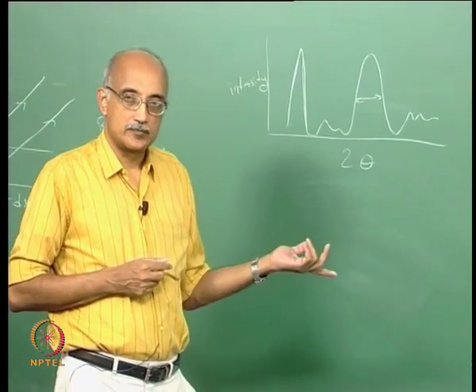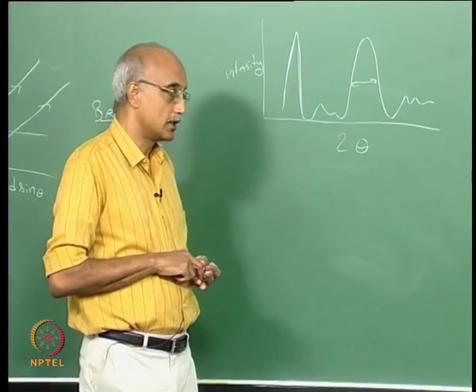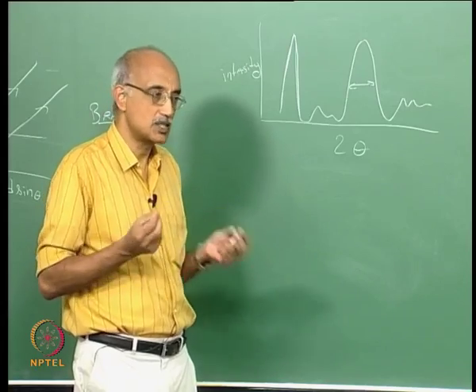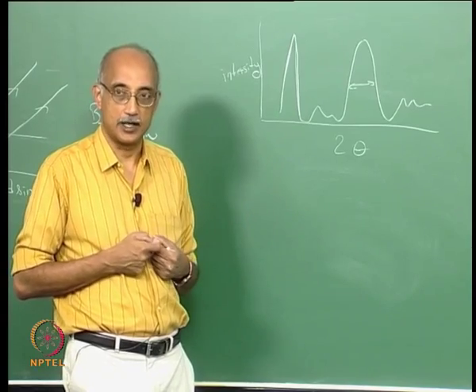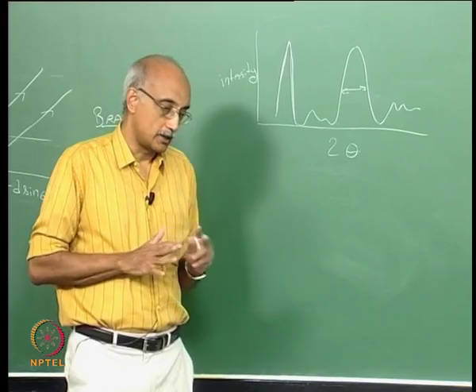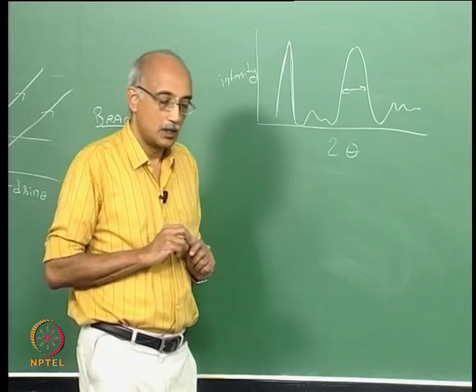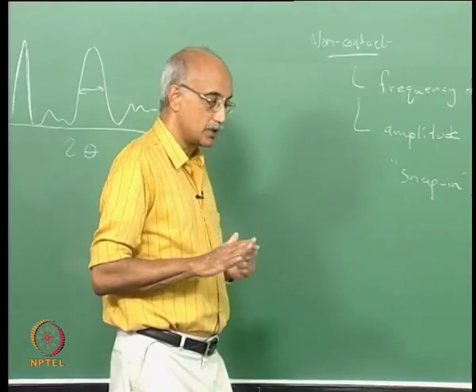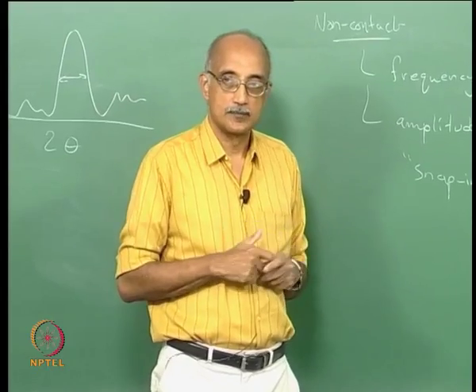and so is XRD. And again, if you look in literature on particle characterization, especially again as you go to the nano sizes, you will see that the literature is dominated by results obtained using these two instruments, XRD and AFM. So these are techniques that are absolutely vital if you want to get into nanotechnology. And so it's a good lead in to what we are going to talk about in the next module of this lecture, which is nanoparticle characterization.